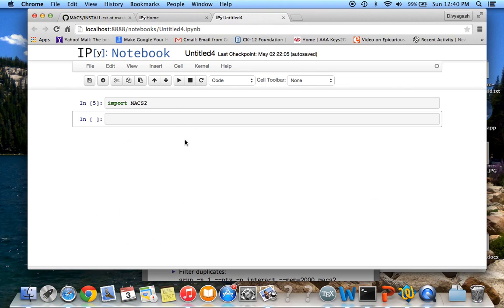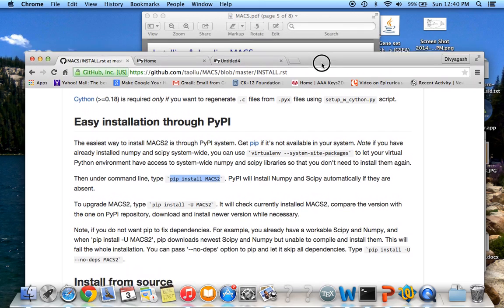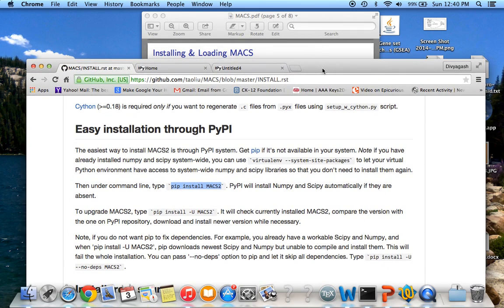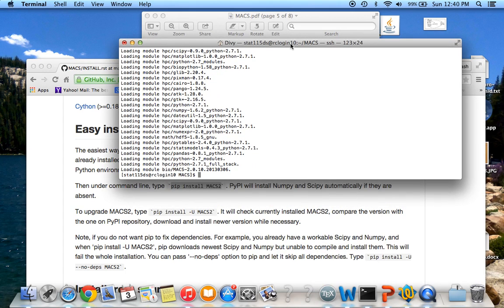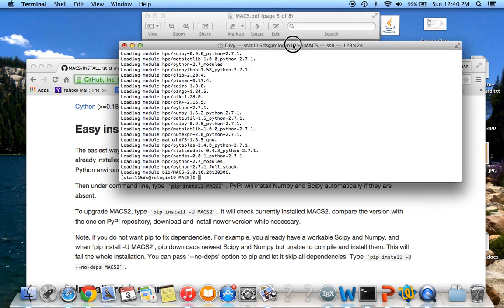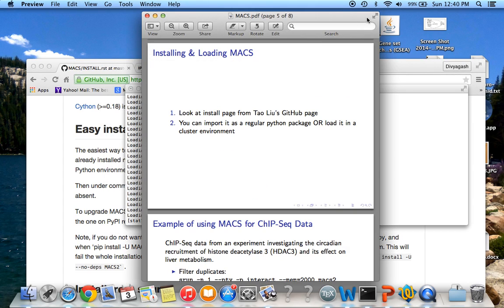After installation you can use it as a regular Python package with import MACS2. In this example I'm going to use it in the cluster because the input file is very large. The way you load it in the cluster is using the module load command after installing it.